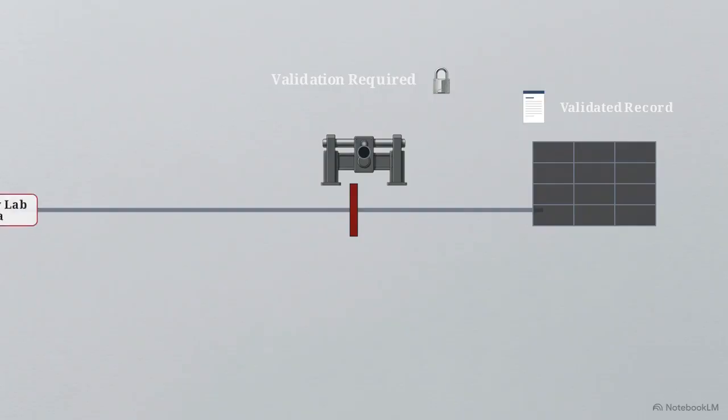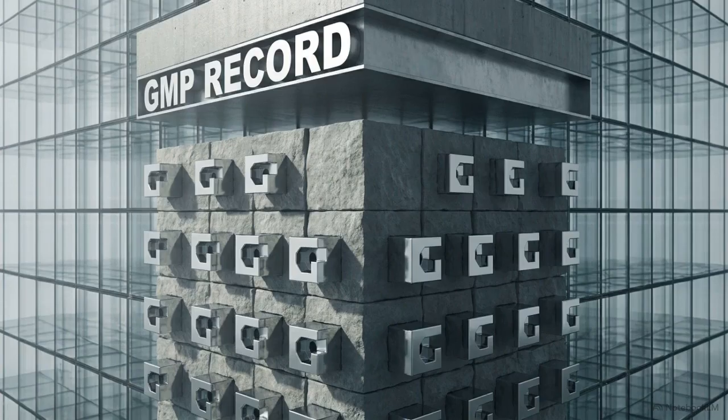This diagram illustrates the core rule of good manufacturing practices. Raw laboratory data must pass through a strict validation-required logic gate to confirm mathematical accuracy and enforce access controls before the system accepts the input. Locking these variables establishes complete traceability. This creates a secure, permanent electronic record designed to meet stringent GMP standards.